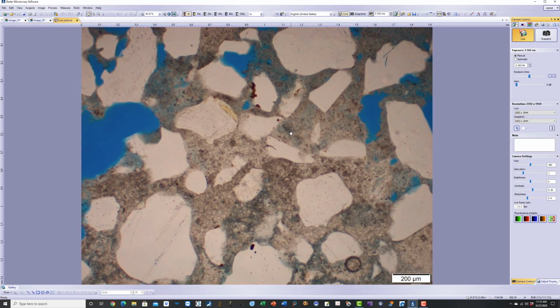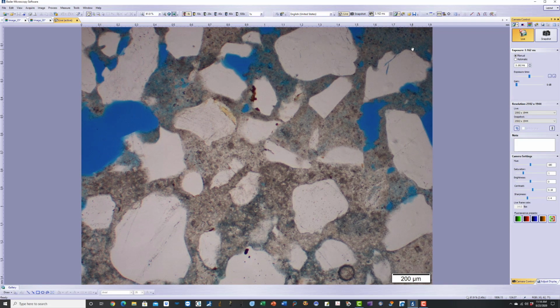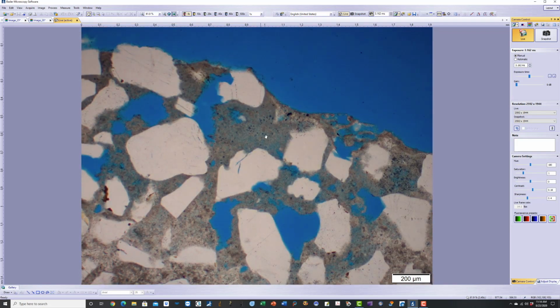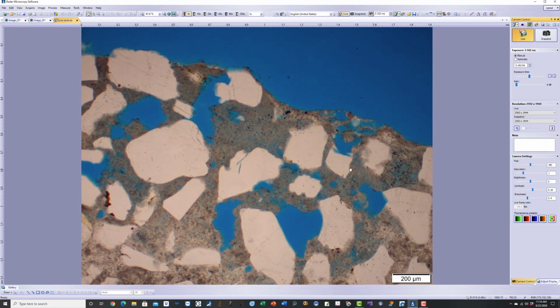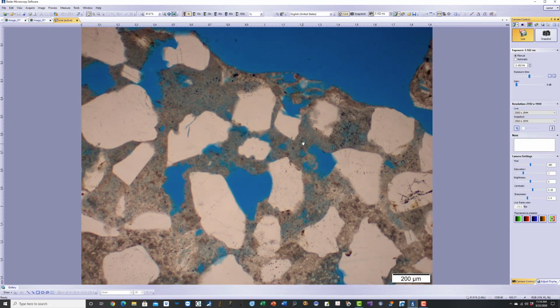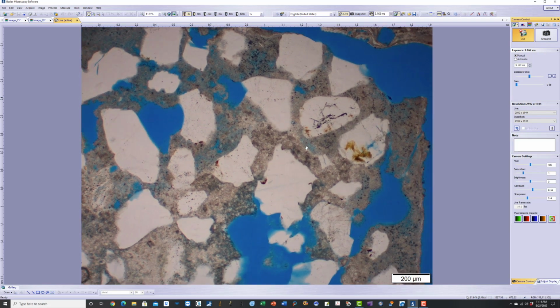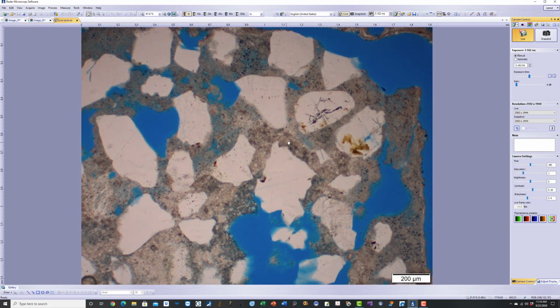You have some areas porous, some areas dense, and in the denser areas you have a lot of residual cement particles. You can see the residual cement particles left in the dense patches, whereas when we go to the porous patches of paste, you don't see the residual cement particle except some dark skeleton of the ferrite phase. And here the paste is porous, so it absorbs the blue dye, blue epoxy, so it shows a much darker blue color, as opposed to less blue color in the darker, denser areas due to lesser absorption of the blue dye.